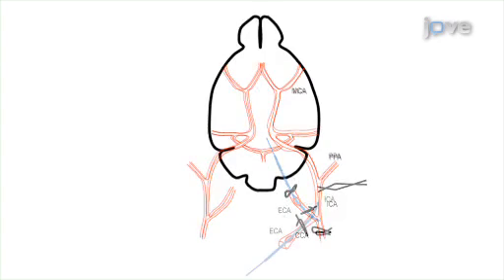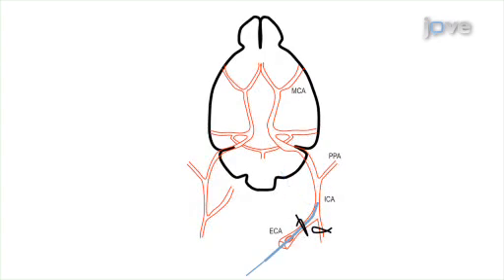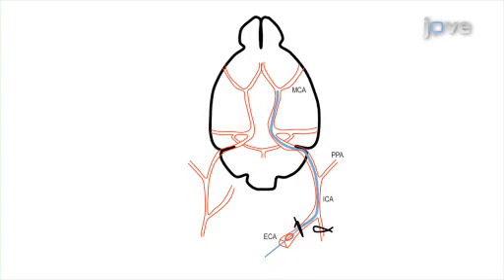Then, the ECA is inverted to introduce the monofilament into the ICA until it occludes the base of the middle cerebral artery.